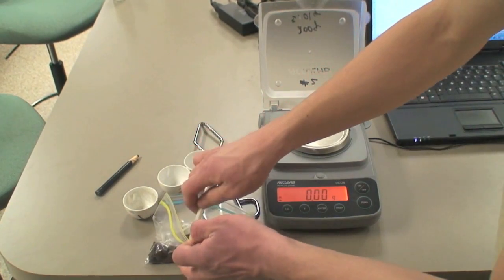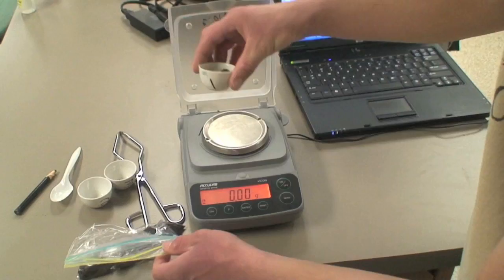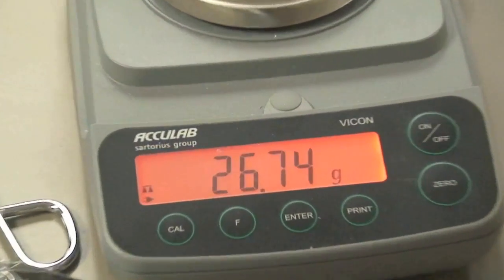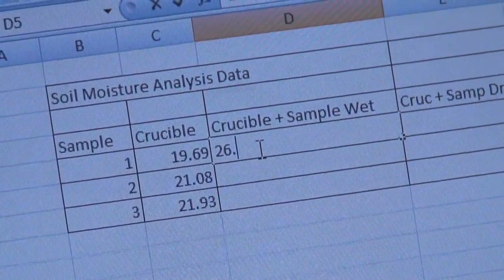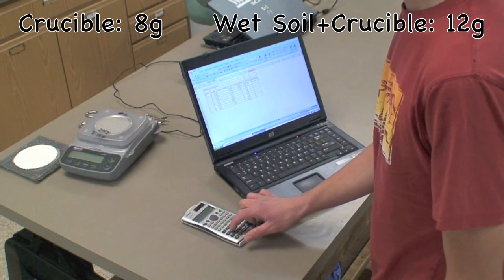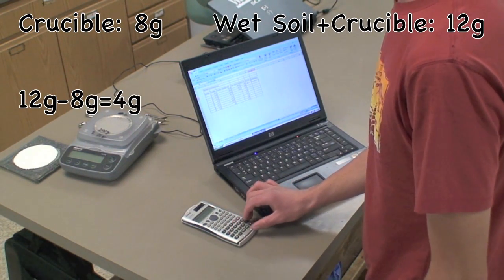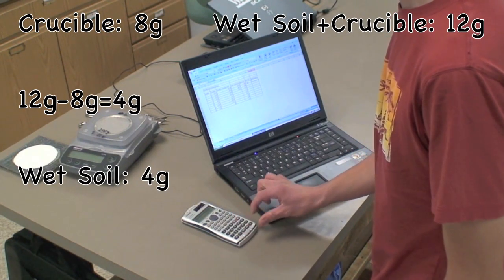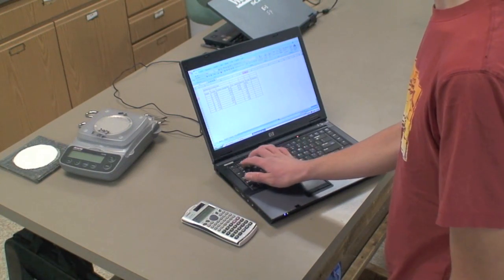Now put some of the soil from the sample into each of the crucibles and weigh them again. Put these weights into your data table, being sure to note that the soil is wet. Now subtract the weight of the crucible from the combined weight of the crucible and wet soil. This gives you the weight of the wet soil alone. Do this for each crucible containing soil and enter these weights into your data table, noting that the soil is wet.